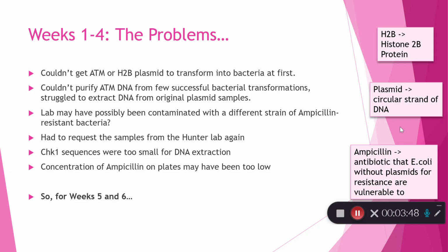It's also possible that at some point the concentration of ampicillin on the plates might have been too low, and this would have allowed bacteria without ampicillin resistance to grow on them, which is why at some point we saw satellite colonies on some of the plates.